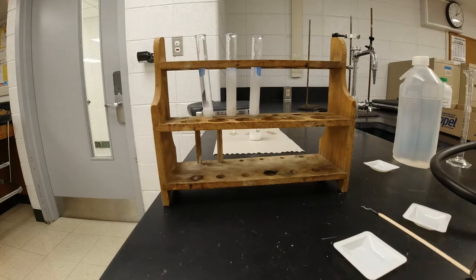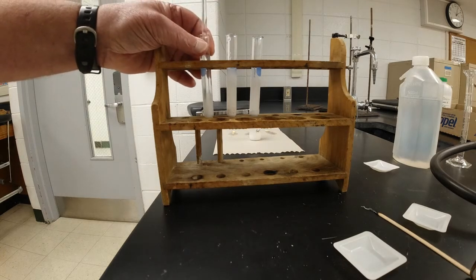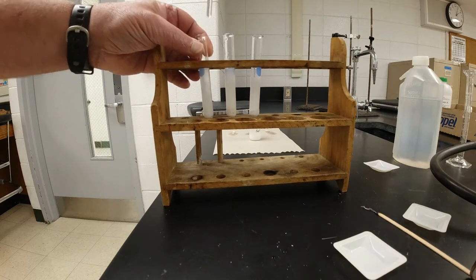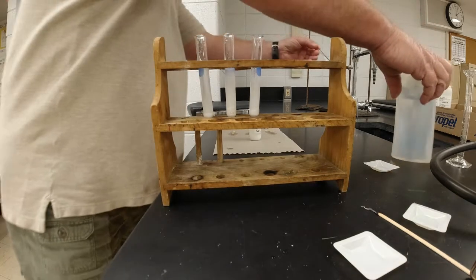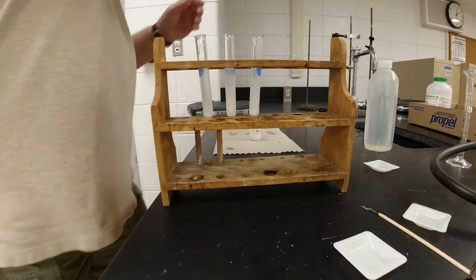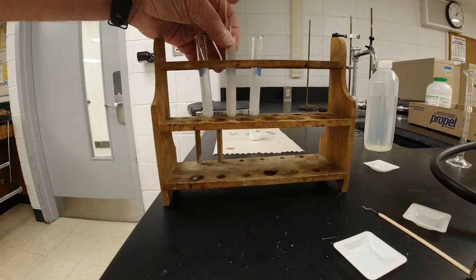All right, so now what I need to do is I'm going to take a glass stirring rod and I'm going to stir each one of these a bit. So I'm going to stir them about the same amount. And so I don't get any contamination, I'm going to rinse off this stirring rod every single time. What would also work is if I used a different stirring rod. So now let's stir this one up.